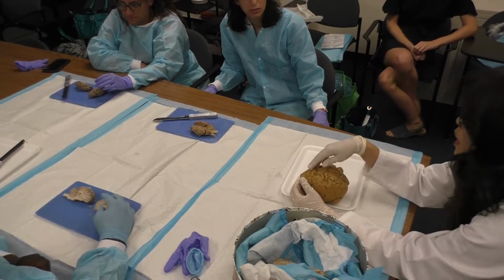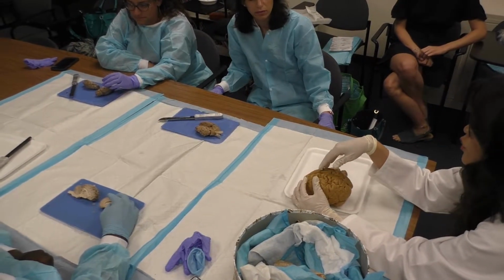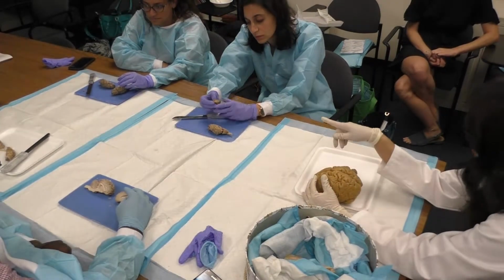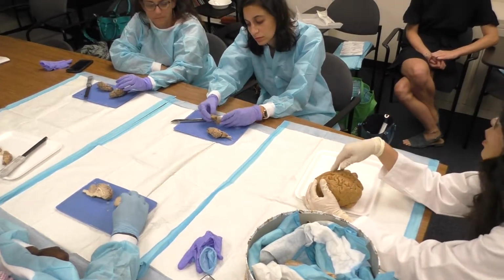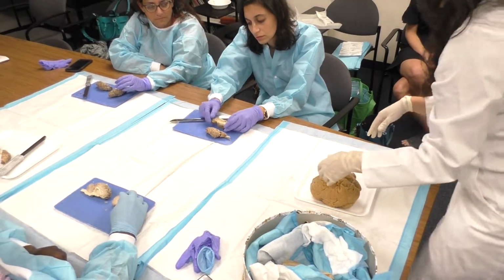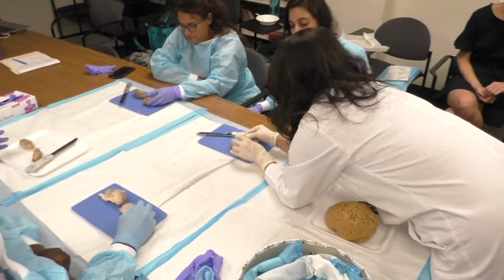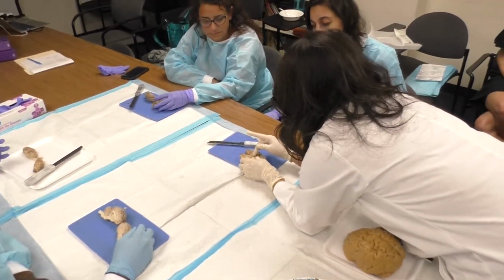But the other structure that's important for fine motor movement is the striatum, and we're looking at part of the striatum called the caudate. So it forms the lateral wall of the lateral ventricle. And now we're going to move down here.